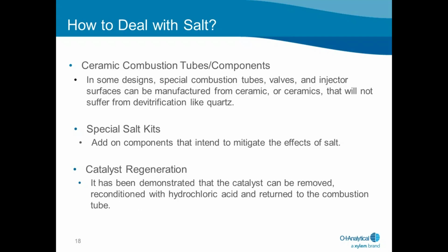In other schemes, ceramic tubes and valve surfaces are used. Ceramic tubes, while effective, can be rather expensive and will eventually require replacement. There are also special kits that use combustion tubes of a special geometry and packing scheme that have been used in some instances.